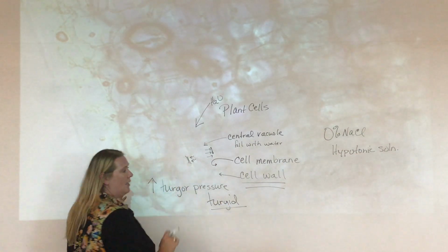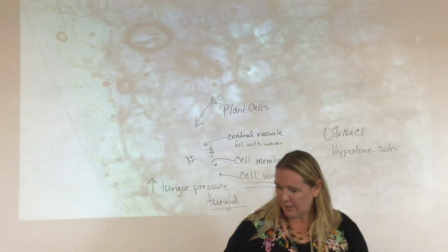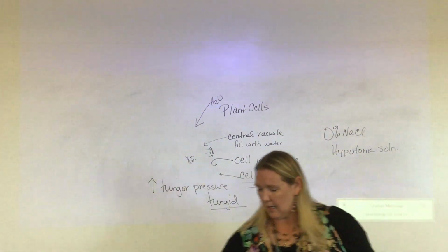That's pressure. Okay, so I'm going to try a different one to see if we can get a better result. Okay, so the next one. Let's go back to this and answer our questions. Make sure I answered those because I think I did.